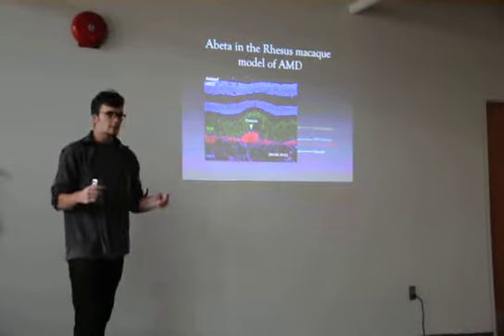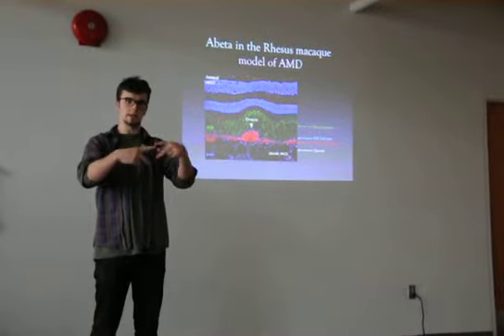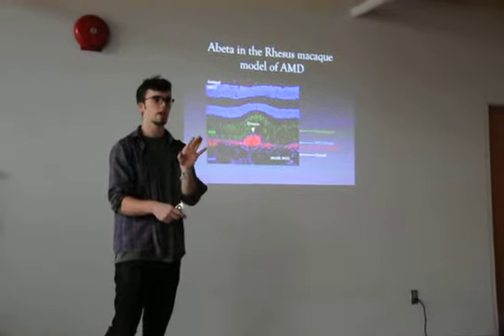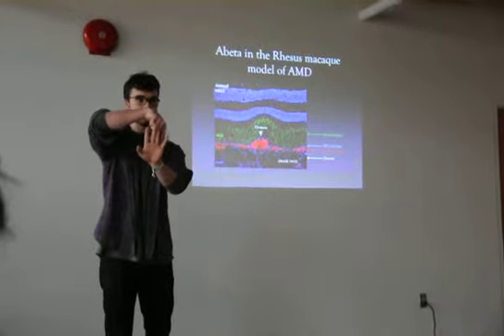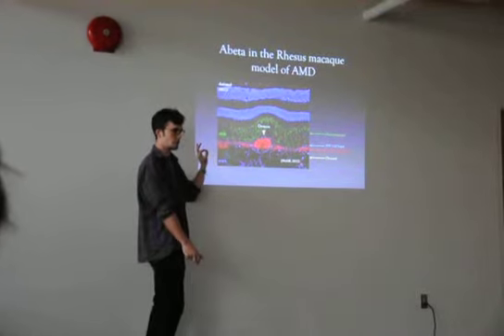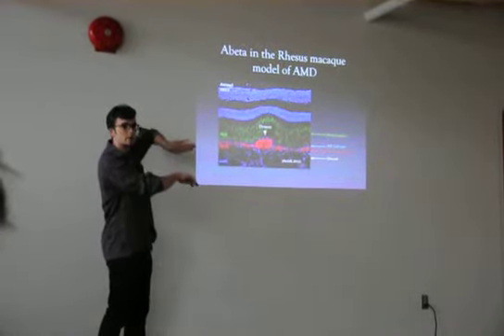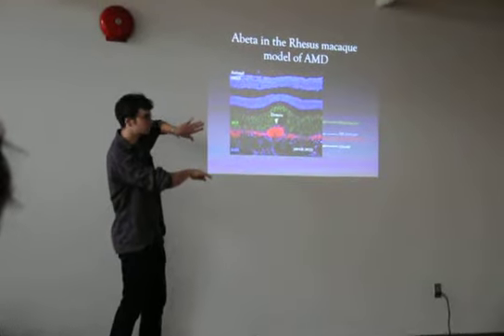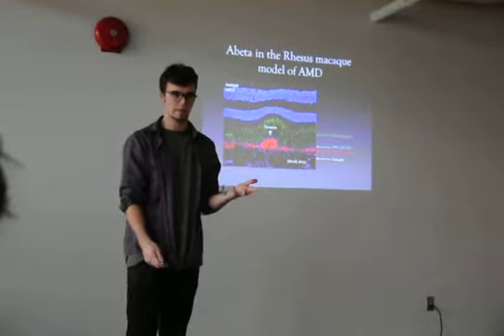Now, I told you that antibodies are specific to the same molecule, so they should bind in the same locus of tissue because they're identifying the same thing. So if A-beta is in one section of tissue, both antibodies should bind to it there. So we should see this glowing in the same region of tissue. However, we're seeing it in mutually distinct layers of the retina. These antibodies aren't identifying A-beta in the same place. So this is a very odd pattern of expression. This isn't what we would expect.